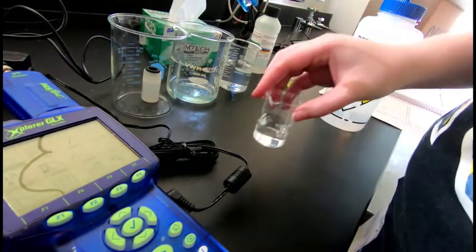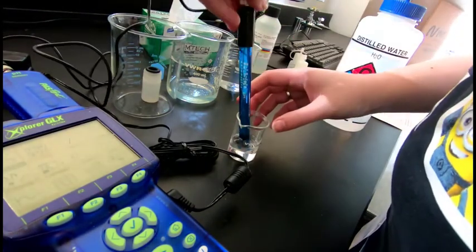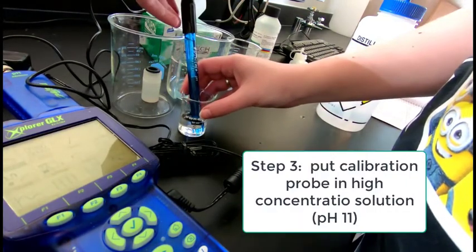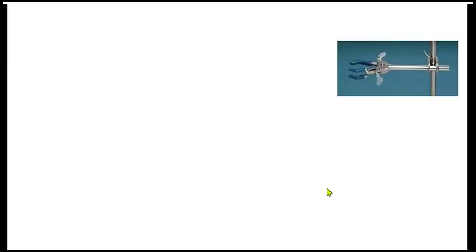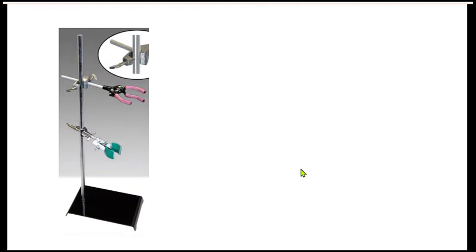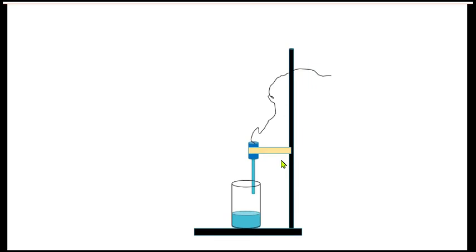So that's the first buffer solution. So it's pH 11. It's in that little vial. So she's going to set that up in there and let it settle in. Here's an alternative way to mount those pH probes. Get your three-fingered clamp. Get the smaller one. Or you can get a standard barrette clamp. And then what you can do is put those on a ring stand. Not both of them, but either one you want to use. And use that to mount your pH probe. And that way you won't have to worry about knocking over your sample or your pH probe. And you can just lower it down into the solution when you're ready to make a measurement.